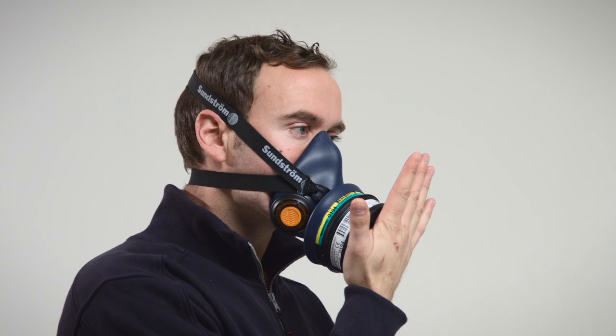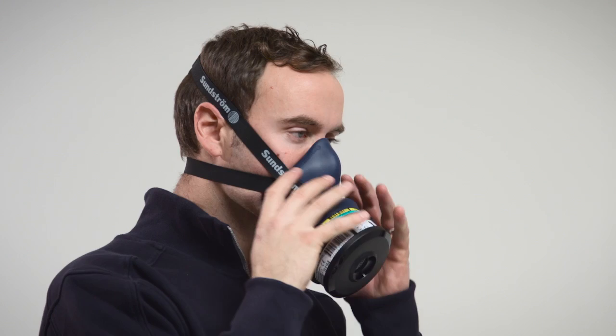If any leakage is detected, check the inhalation and exhalation valves. Adjust the straps of the head harness or switch to an alternative size of respirator. Repeat the fit check until there is no leakage.